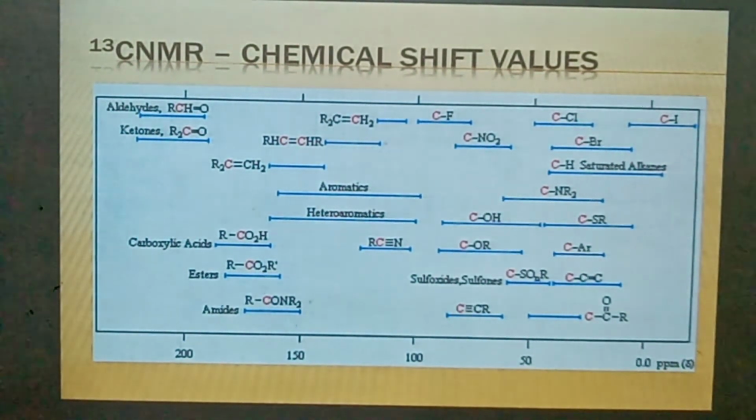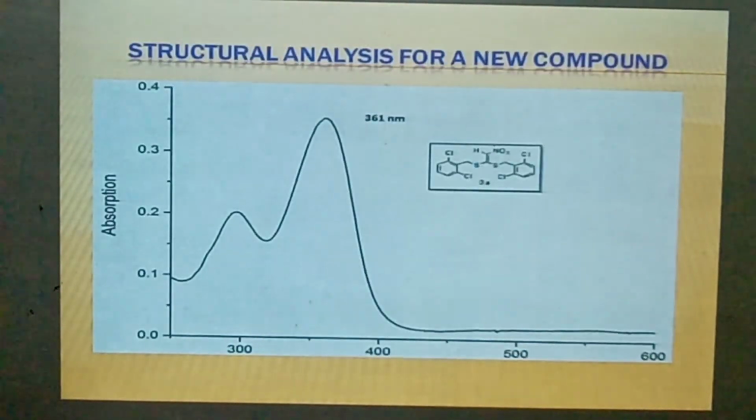All these different types of carbons are measured broadly between 0 to 200 ppm.